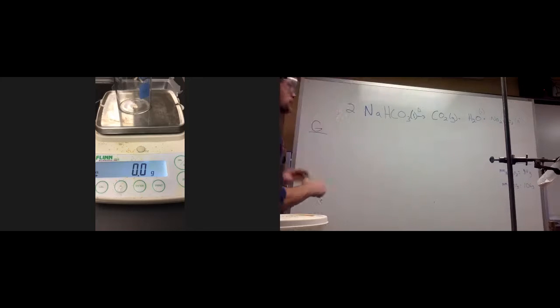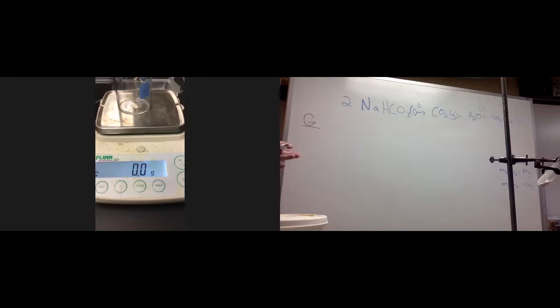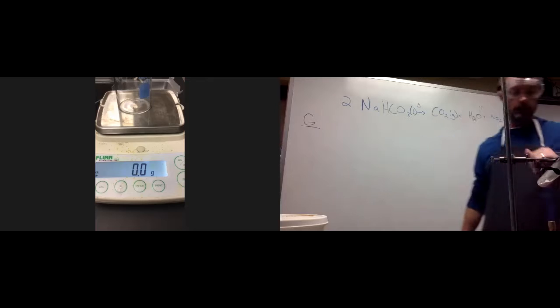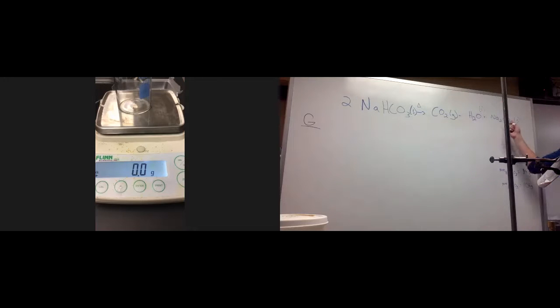Okay, so think about the goal of this lab. Maybe I didn't say this at the beginning, but the goal of this lab is to decompose this sodium bicarbonate and determine how much sodium carbonate is going to come from that. The gas is going to escape. The liquid is going to escape. Eventually, I'm going to shift this Bunsen burner up so that I'm boiling the water off that's condensing on the sides. So the only thing that's left in this test tube should be sodium carbonate.